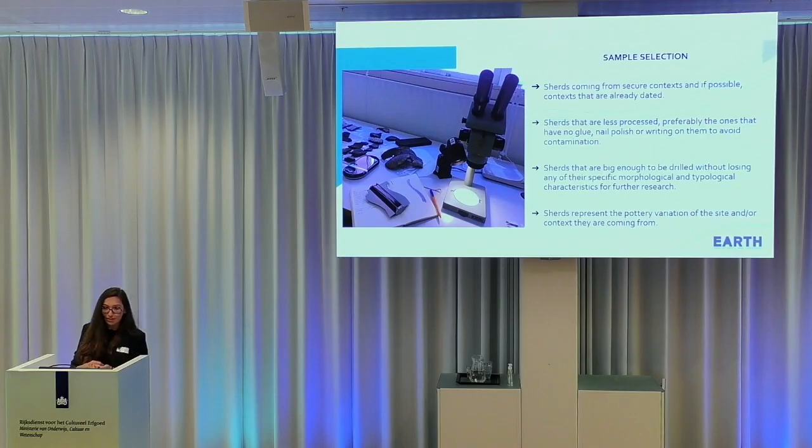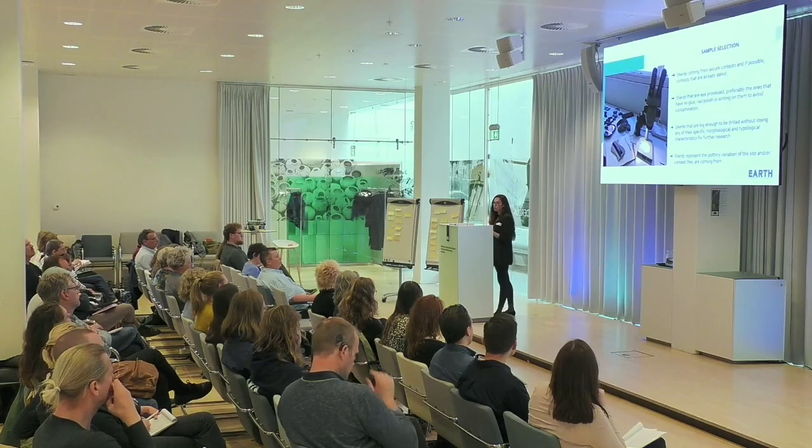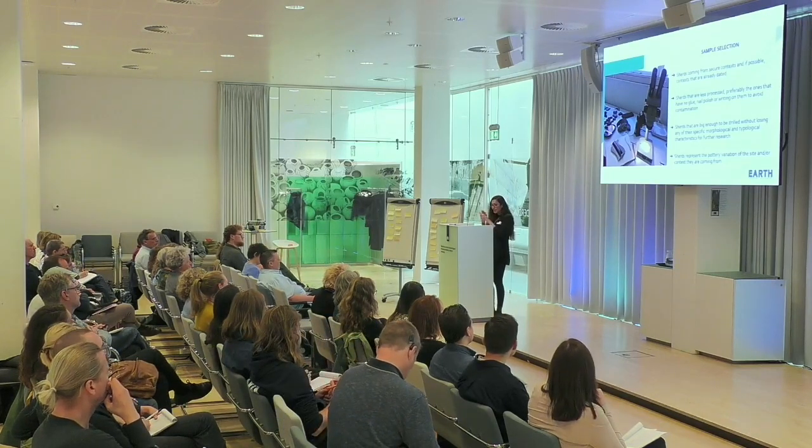And because it's a very destructive methodology, I will drill into your pottery, I will make holes in your pottery. So you have to be sure that there is enough left for further research. And also you want to be sure that you photograph, document and draw your pottery, and do everything else that needs to be done before lipid residue analysis, because after that I might just give you pieces of fragments that you can't do anything with.